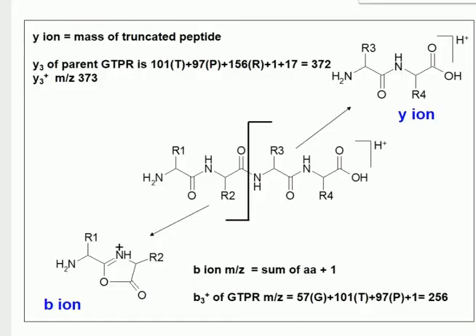Right, so I was just drawing coloured circles on a piece of string as an illustration for a peptide, but of course they've actually got a molecular structure. Okay, so this is a model tetrapeptide. When you do CID, you get cleavage of the peptide bond, so you get a Y ion, which contains the C terminus, or a B ion, which contains the N terminus.